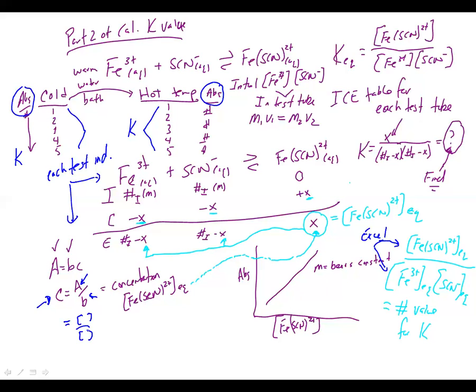You know, you can kind of talk about those type of things. But you do want to make sure you still go through the data analysis section. It should walk you through the calculations like I just kind of did sloppily here on the board, but it will tell you what to calculate. And just like normal, anything that it says to calculate within the data analysis section should be calculated, and obviously probably should end up in a table that you make of yourself of proper values.